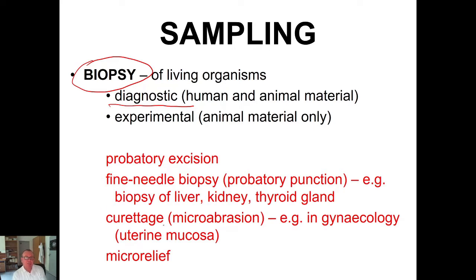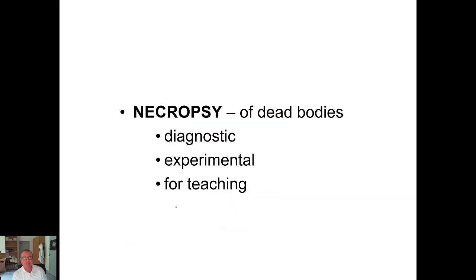Curettage is a method which is used usually in gynecology, microrelief. All these methods can be used by a surgeon or gynecologist or other doctor to obtain the tissue. Then the tissue is sent to the lab. Necropsy is the sampling of dead bodies, of course.